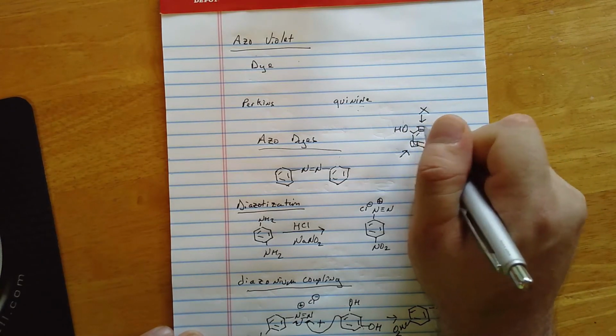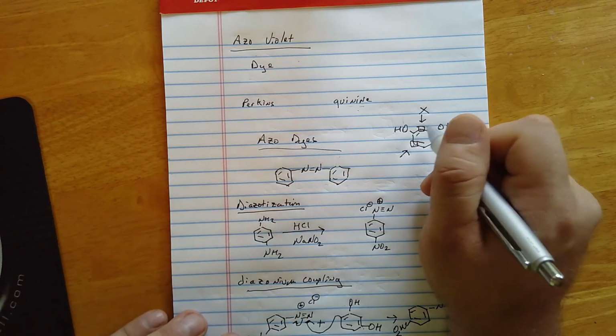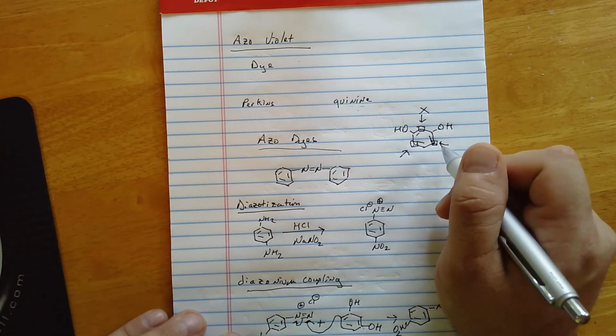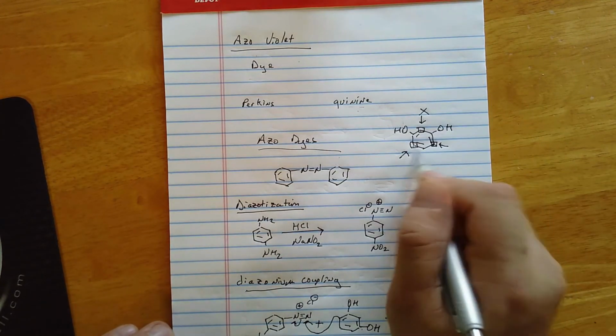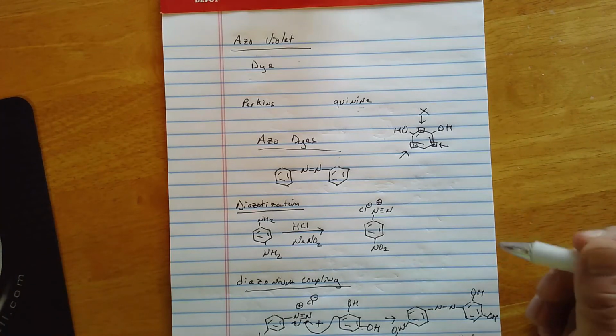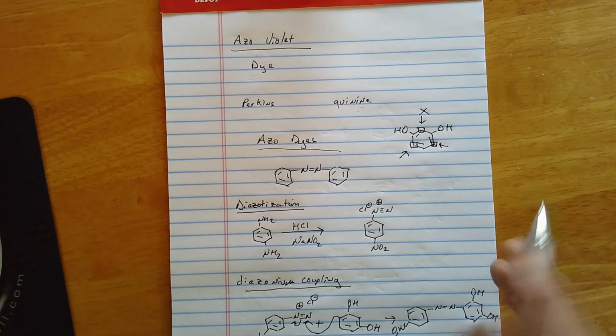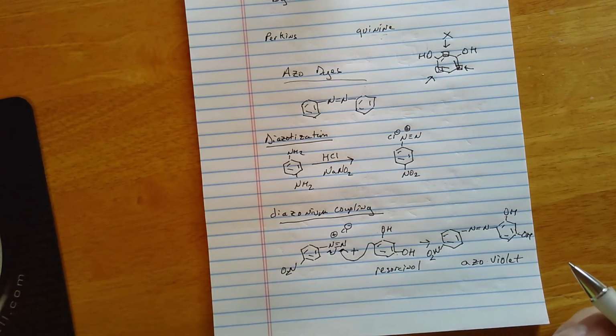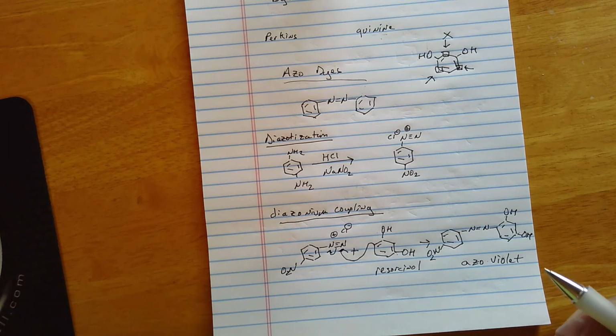And because the reaction is not going to occur at this position because there's just too much steric hindrance, the only reaction that's going to happen is at this position. And again, since these two carbons are identical to each other, you get the same product regardless. Okay, so again, azo violet synthesis is a very simple reaction and does not take much time.